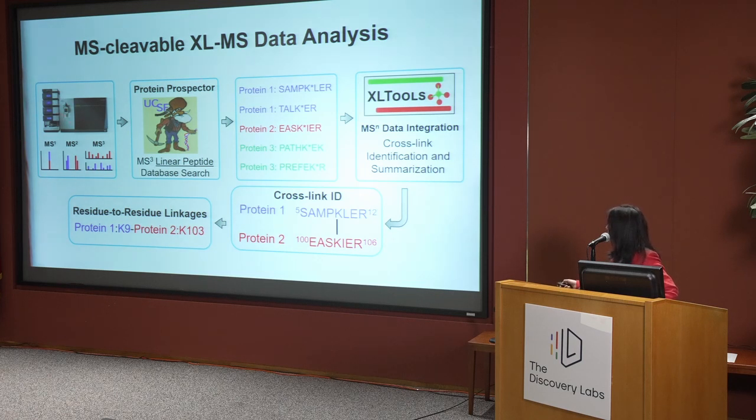Here, we use LC-MSn to acquire the data, and then use the conventional database searching tool to search the linear peptides. Because for interlinked peptides, if you do the database searching, in general, you will have an expansion of the database searching space. But with this type of MS-cleavable reagent, we can just search the linear peptides, which is much simpler with higher accuracy.